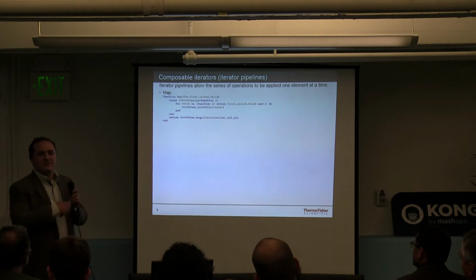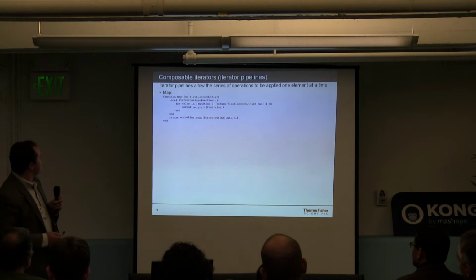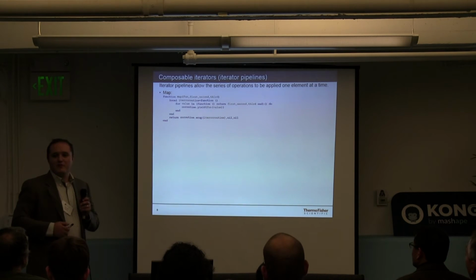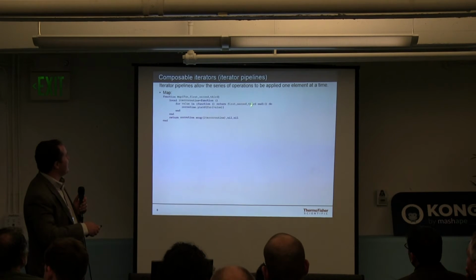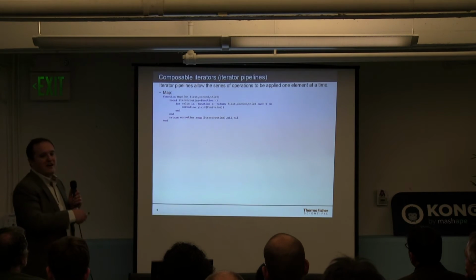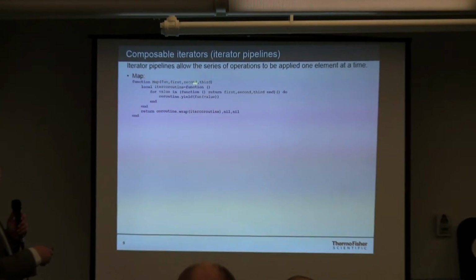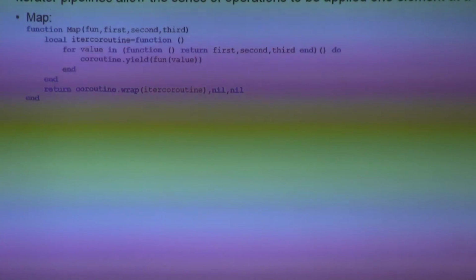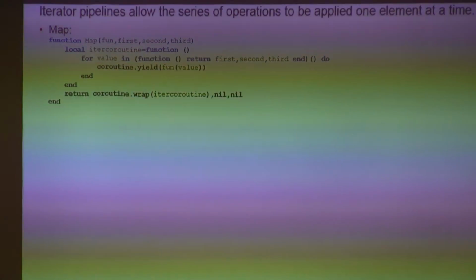We typically want to do things one scan at a time or one compound at a time on an instrument like this. So instead of operating on tables, we want to define map, filter, and reduce for iterators. And we're using the native Lua iterator, which is a function that returns a function, invariant, and a state variable. That was in reverse order of the pointing, that's okay. The same thing you would provide to the generic for. We want to take a function of that thing you feed to the generic for, and map over each value in sequence, and then have this would in turn be something that you put into the generic for itself.